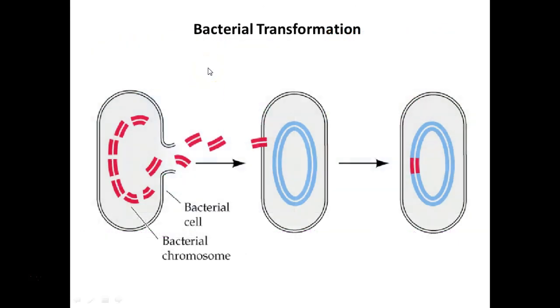So what is bacterial transformation? It's where DNA comes from a source. And in this case, unlike in nature, we're going to be starting with a pre-made circular piece of DNA known as a plasmid. In nature, what happens is typically bacteria will die and their chromosome, their DNA, becomes part of the environment. This can be picked up by other bacteria and incorporated into their chromosome. If they incorporate it and utilize it, they're said to be transformed.